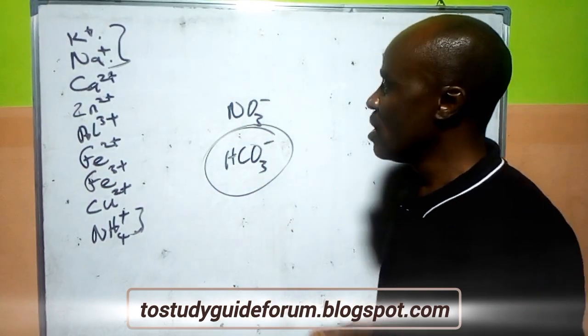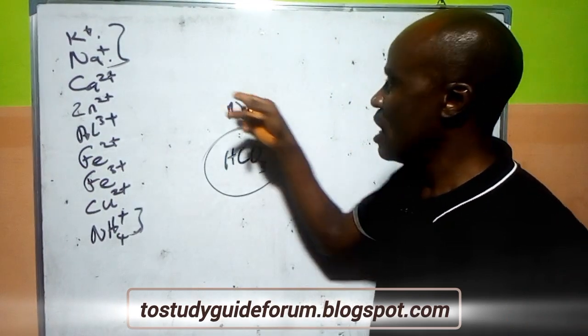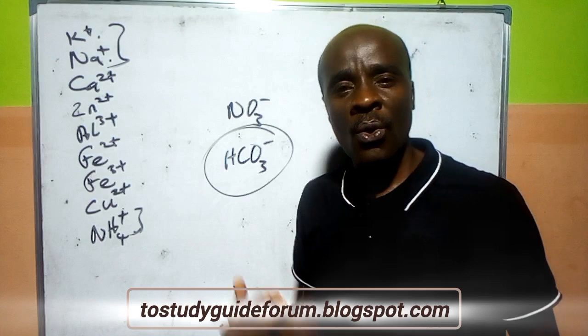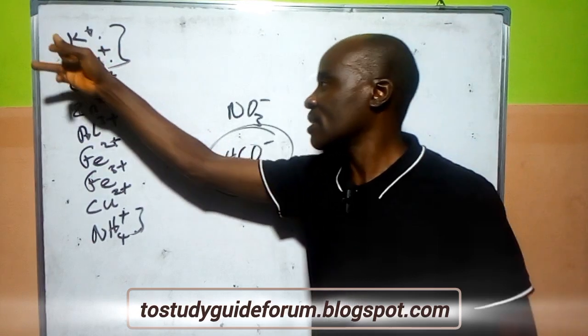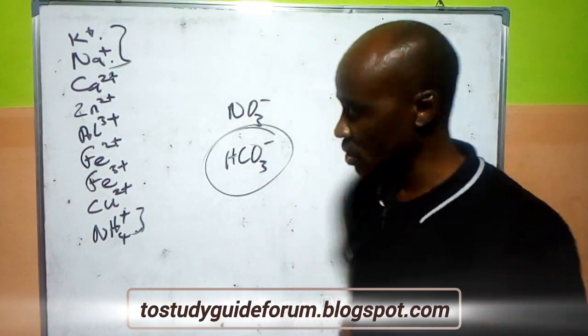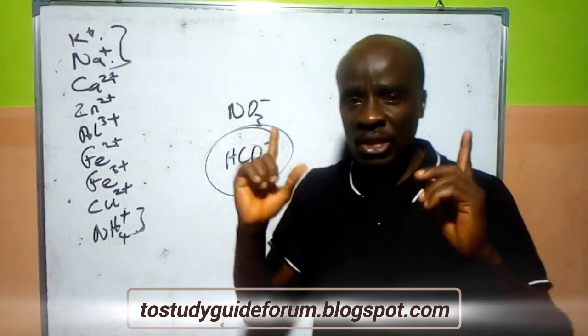That is why, in order to infer, you can go to your inference column and write soluble salts or soluble ions. Perhaps you can also list out these ones that you know are always soluble in every case, because they are known to be soluble and colorless.